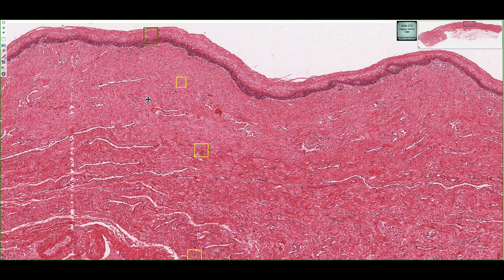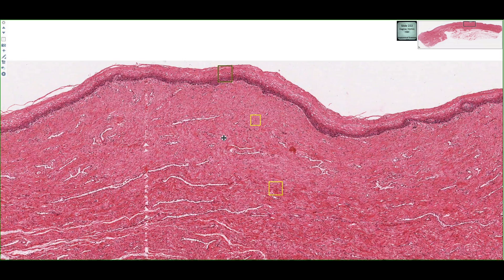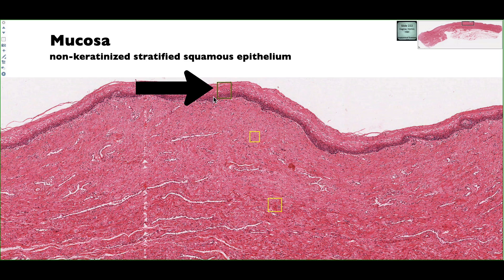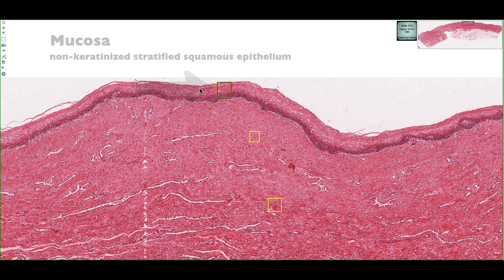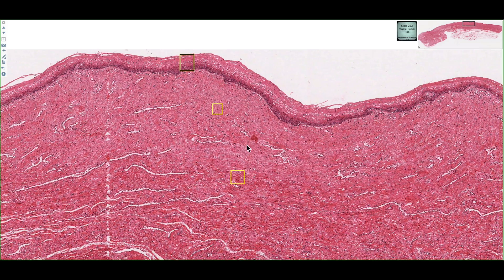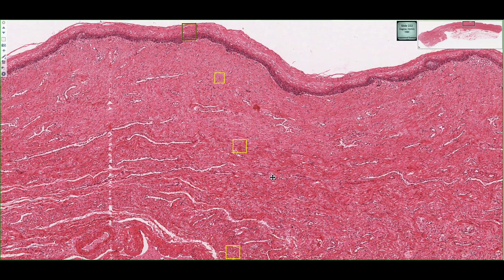The first, if we look at the superficial aspect of this section, we can see a non-keratinized stratified squamous epithelium, and it's supported by a lamina propria, which is just connective tissue and some blood vessels.